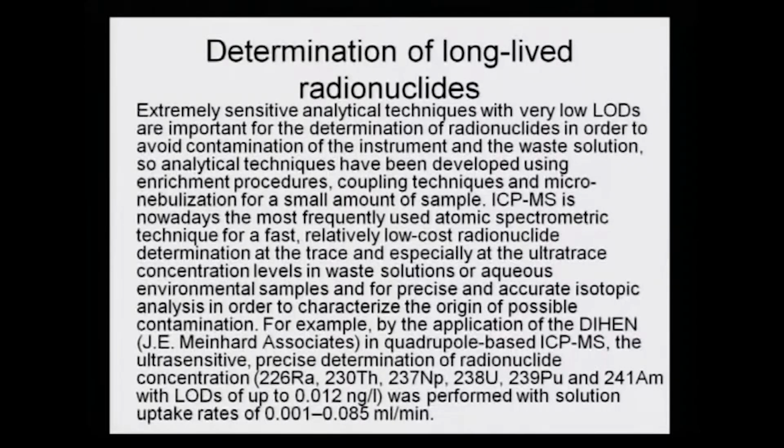So, you see that these analytes are by themselves very special, because they are very hazardous and long lived radionuclides. That means they will keep on giving alpha, beta, gamma rays and will create more havoc. That is why their analytical method needs to be much more precise and a smaller analytical sample should be taken, and this could be analyzed from all kinds of environmental samples. That is why this arrangement is slightly different from the methods that I had discussed so far.